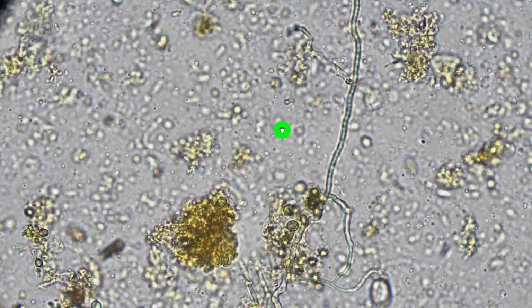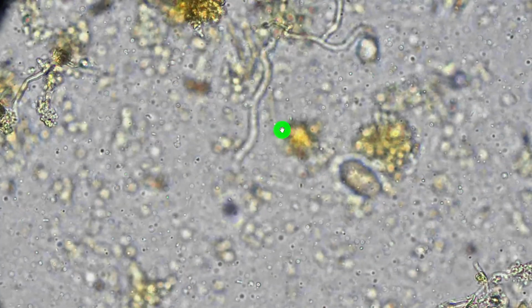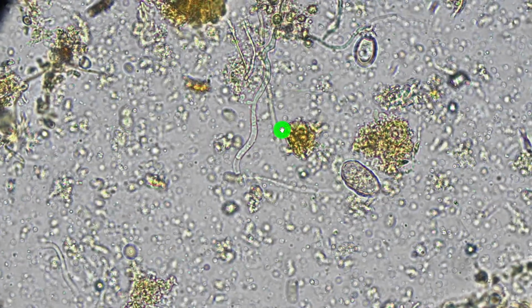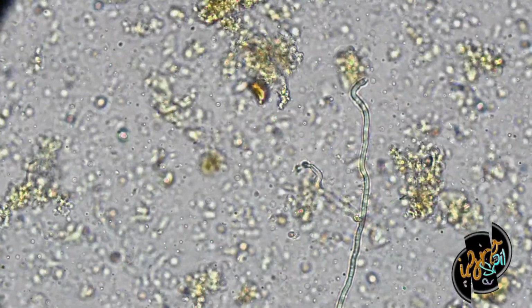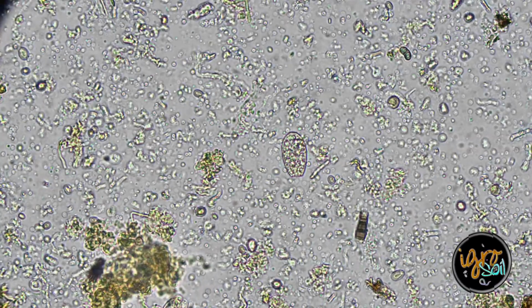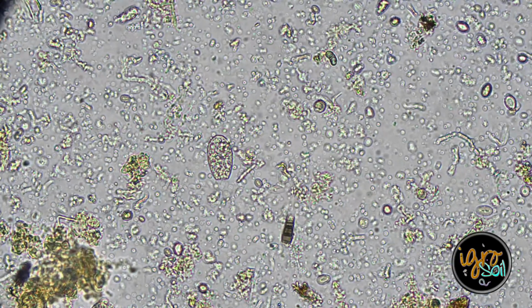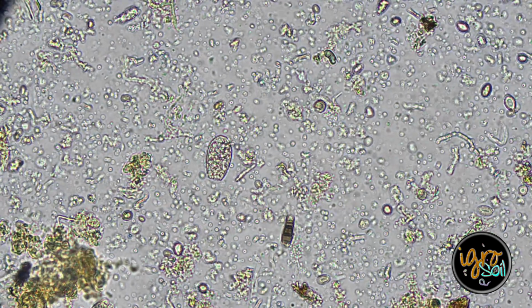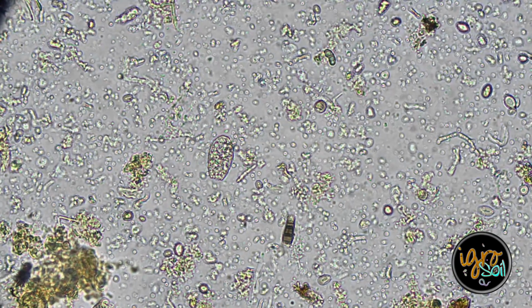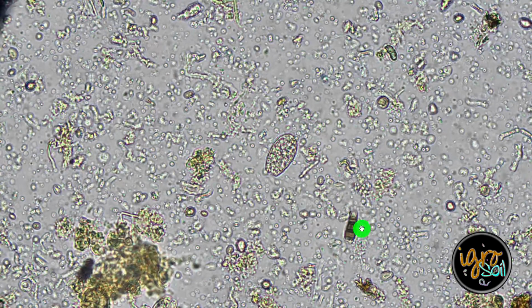So the septa that I was talking about, I look for a consistent septa right here, but this is not consistent, and the color's off too. So that might be an actinomycete. It's a decomposer, which is still great. I'm not complaining about it. I embrace it. I want it in my compost. Actinobacteria share a relationship with the soil. So another testate amoeba there, a good looking testate amoeba right in the middle here.